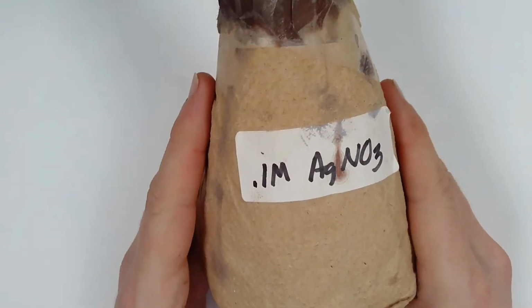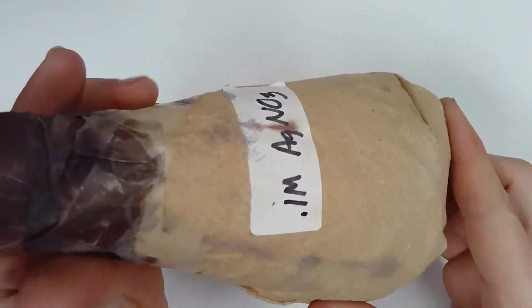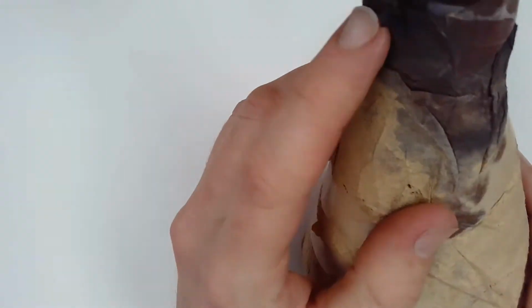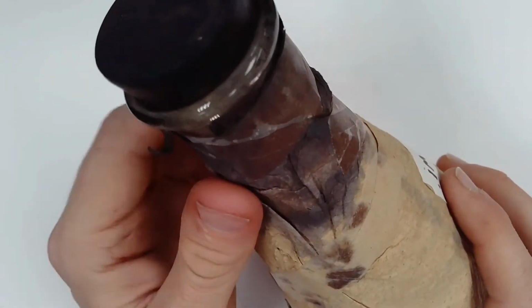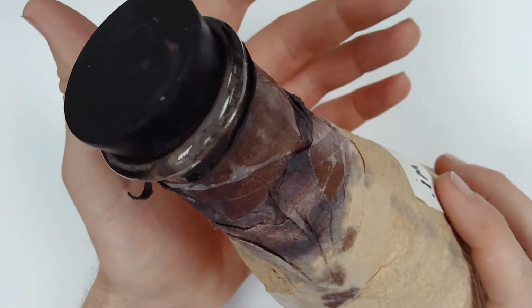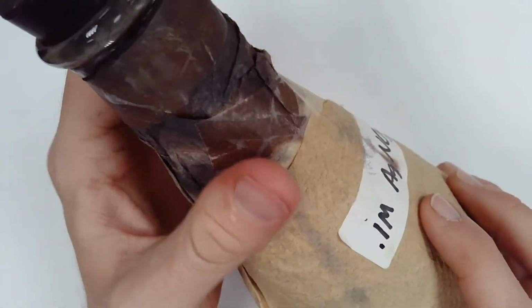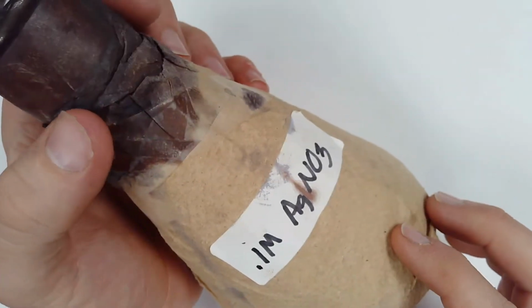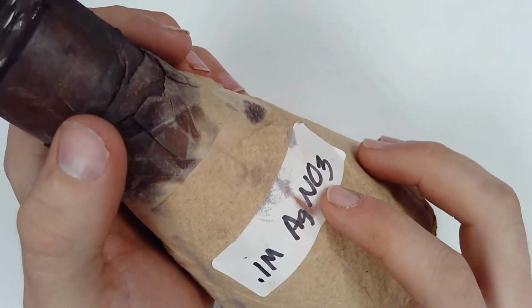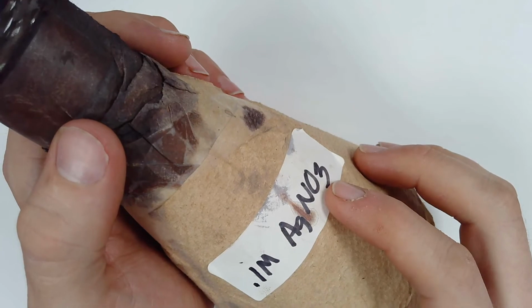I've also got this Erlenmeyer flask, which notice is coated entirely in dark paper towels and covered in stains around the top. So it's really important not to get silver nitrate on your hands. It will stain them. Now this chemical is incredibly important to early photography, right? This is how you get early pictures. Well, different silver compounds like the nitrate. Really, the chloride and the bromide probably matter more to photography. But that's beside the point.